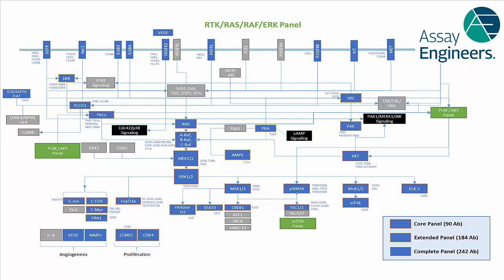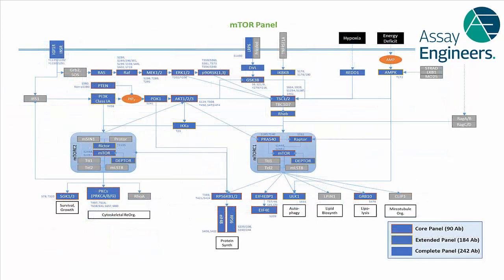You can choose from more than 60 expert-curated pathways, including FDA-approved companion diagnostic markers. The assay configurator currently includes more than 300 phosphoproteins that are not measurable by other platforms. If you are missing a marker relevant to your project, we can easily add custom markers and proprietary antibodies to your Hyperplex panel. Unlike other platforms, Hyperplex does not focus on discovering new, exploratory biomarker candidates.